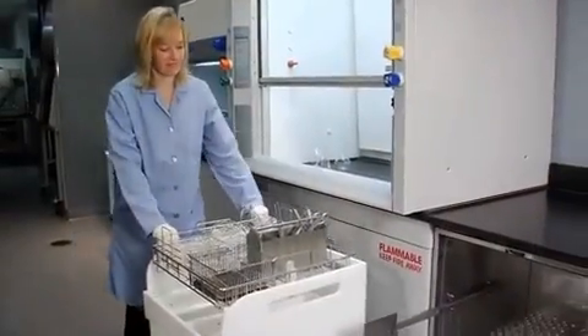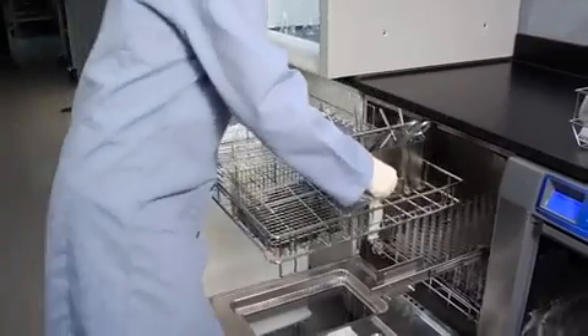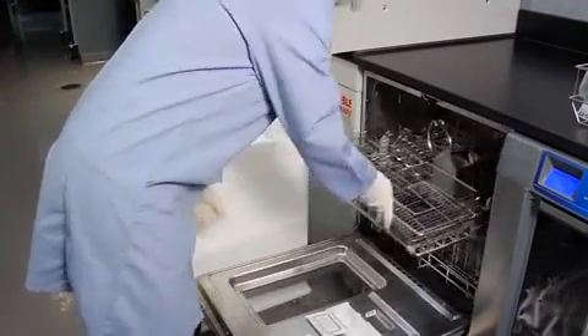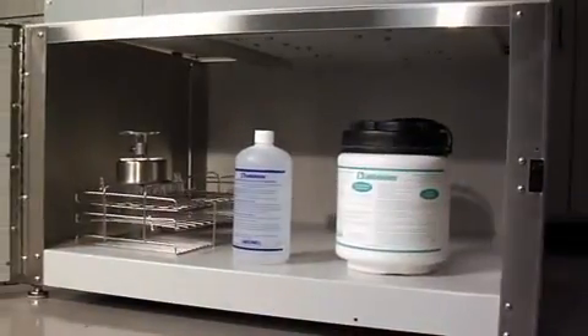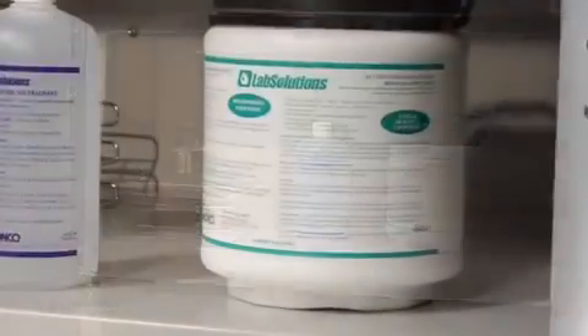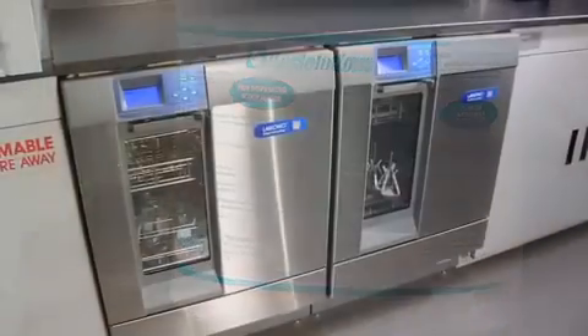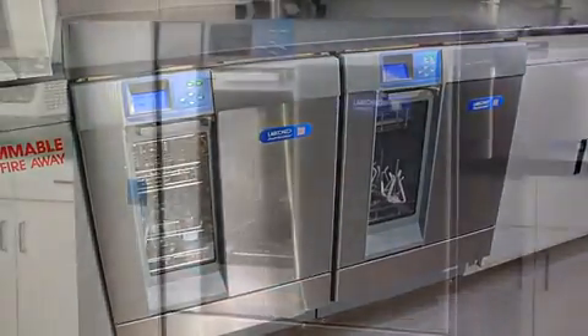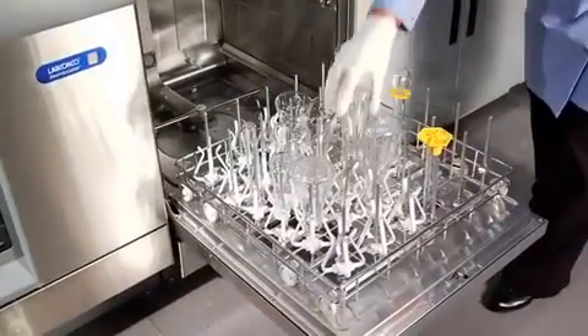The Scrubber Mate glassware and rack cart provides convenient storage and transport of extra LabConco washer racks, inserts, and other miscellaneous glassware. LabConco offers the Lab Solutions line of detergents and neutralizing solution specially formulated for all LabConco washers. The Steam Scrubber, Flask Scrubber, and Flask Scrubber Vantage series come equipped with different rack configurations.